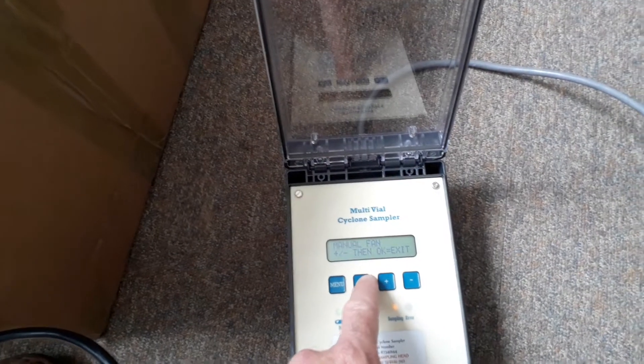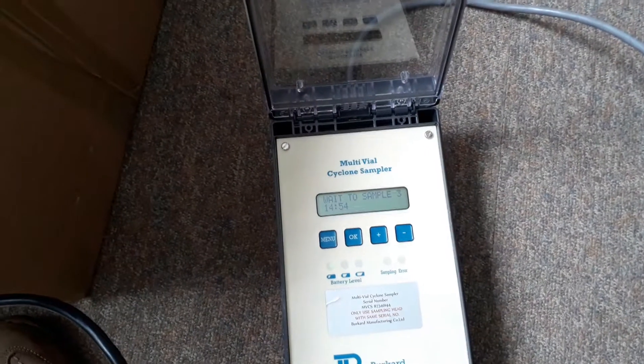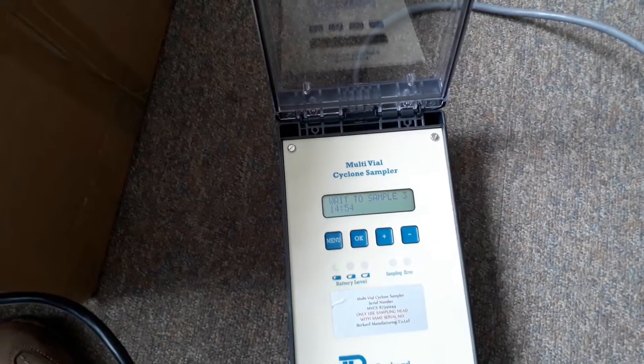If we click OK here, it stops sampling and also advances to the next sample position.